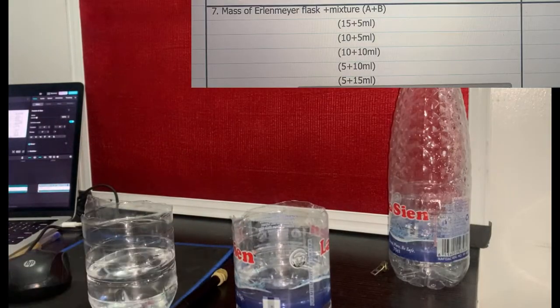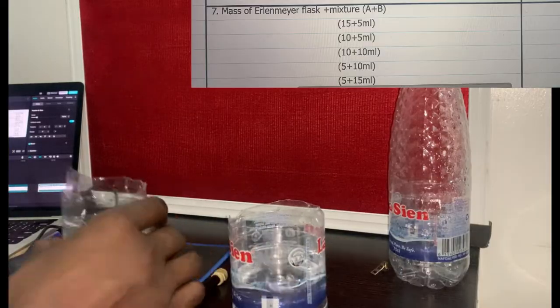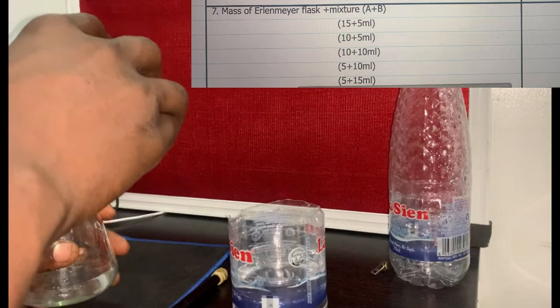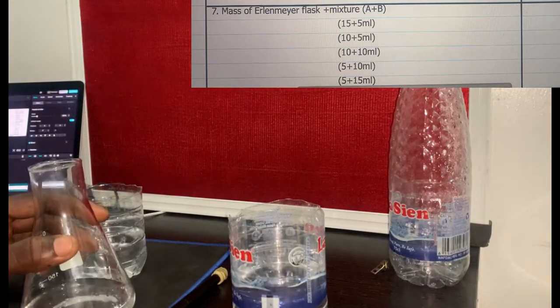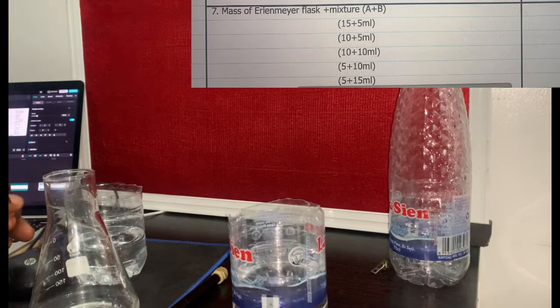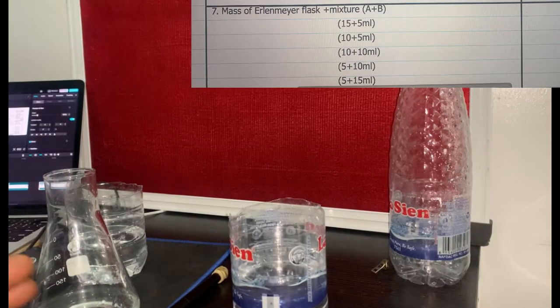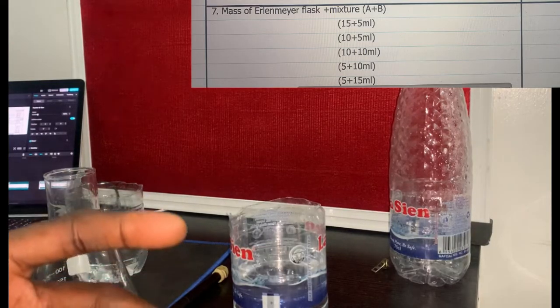Basically, it simply means that I'll take 15 ml of A and put it inside here. That means definitely you're going to use a measuring cylinder to measure your 15 ml, or perhaps you could use your pipettes. If you're using 5 ml pipettes, to get 15 you have to pipette 3 times, because 5 times 3 gives us 15. But for me, I prefer using a measuring cylinder because it will be much faster.